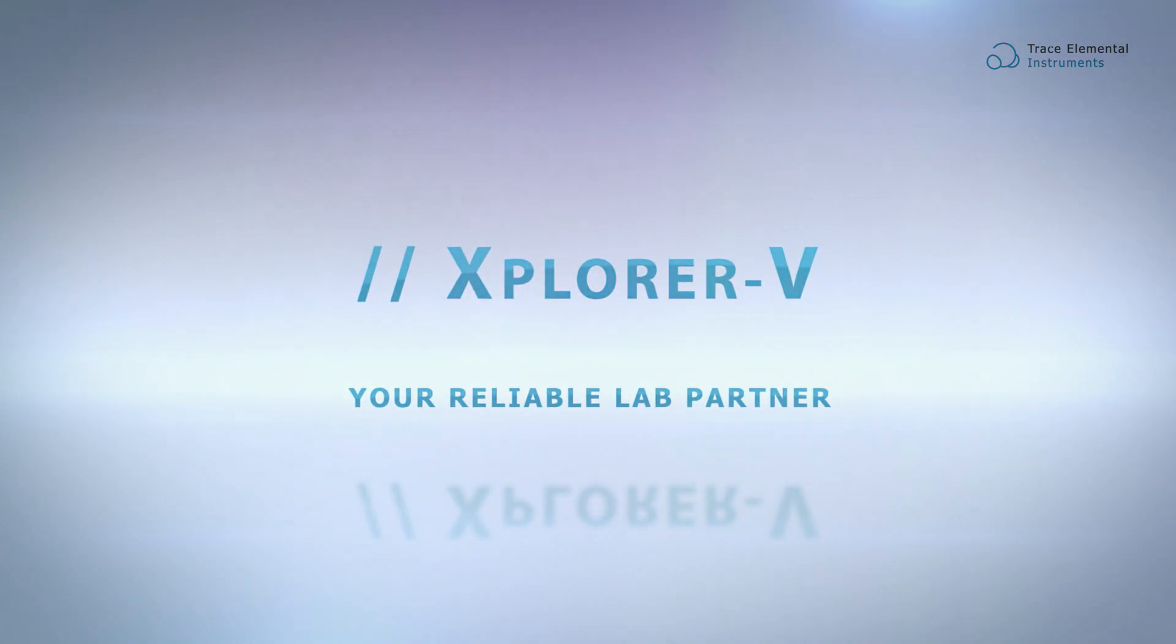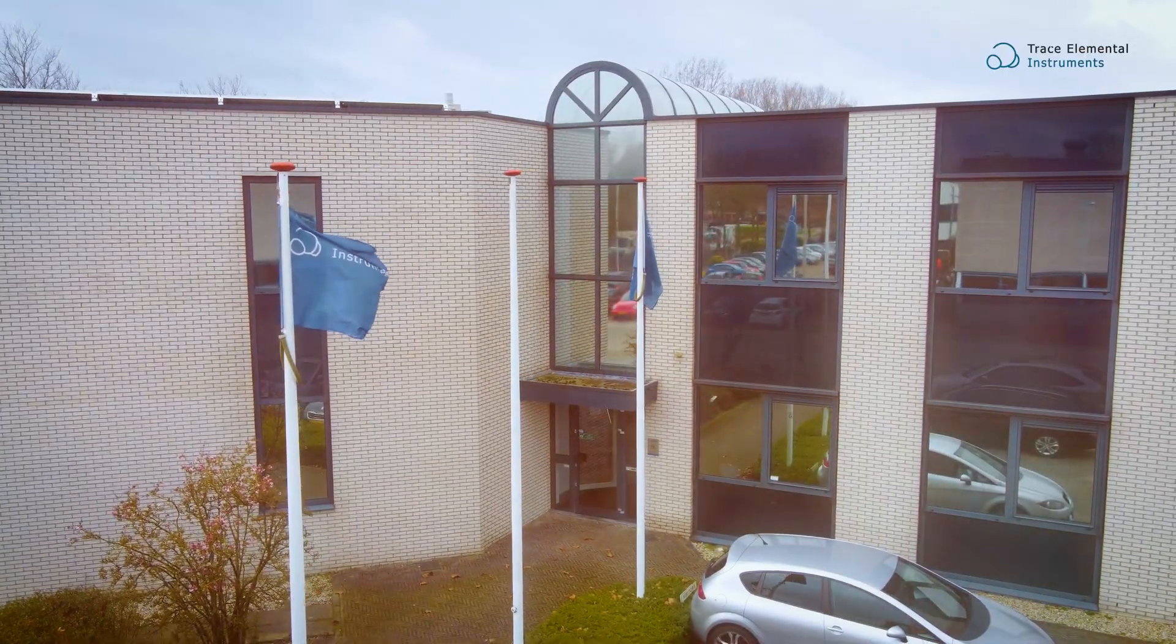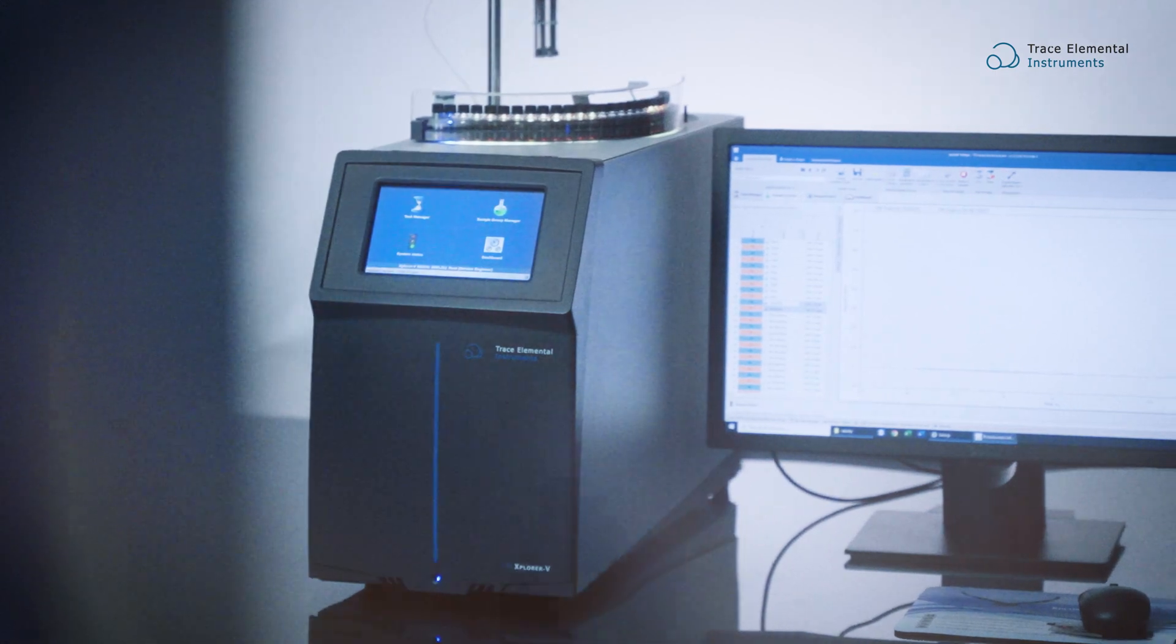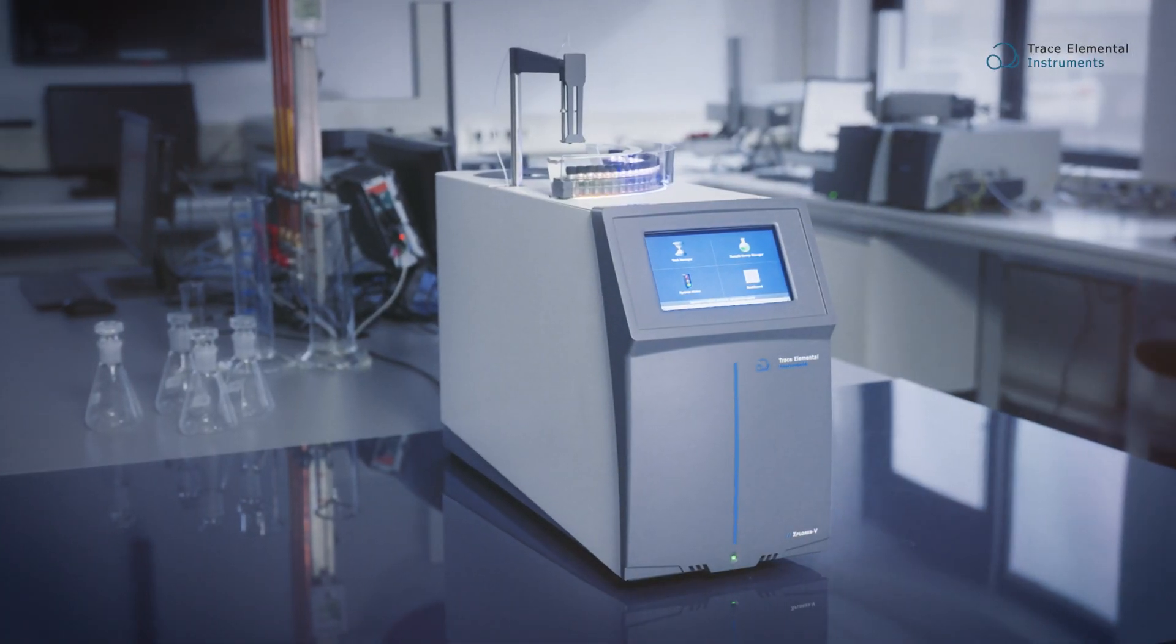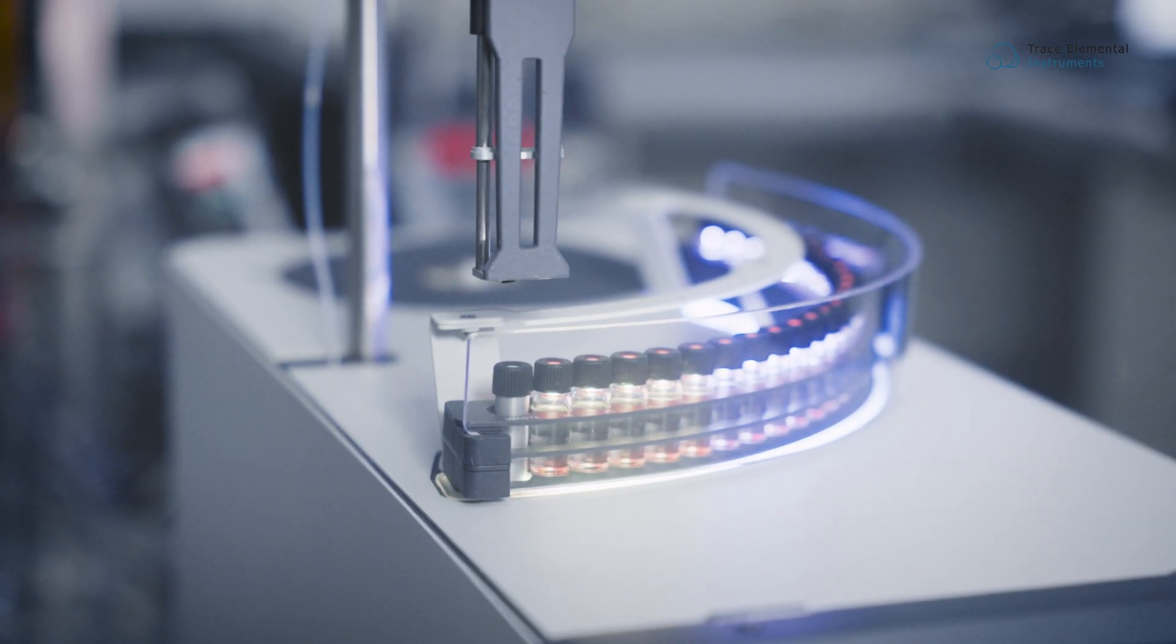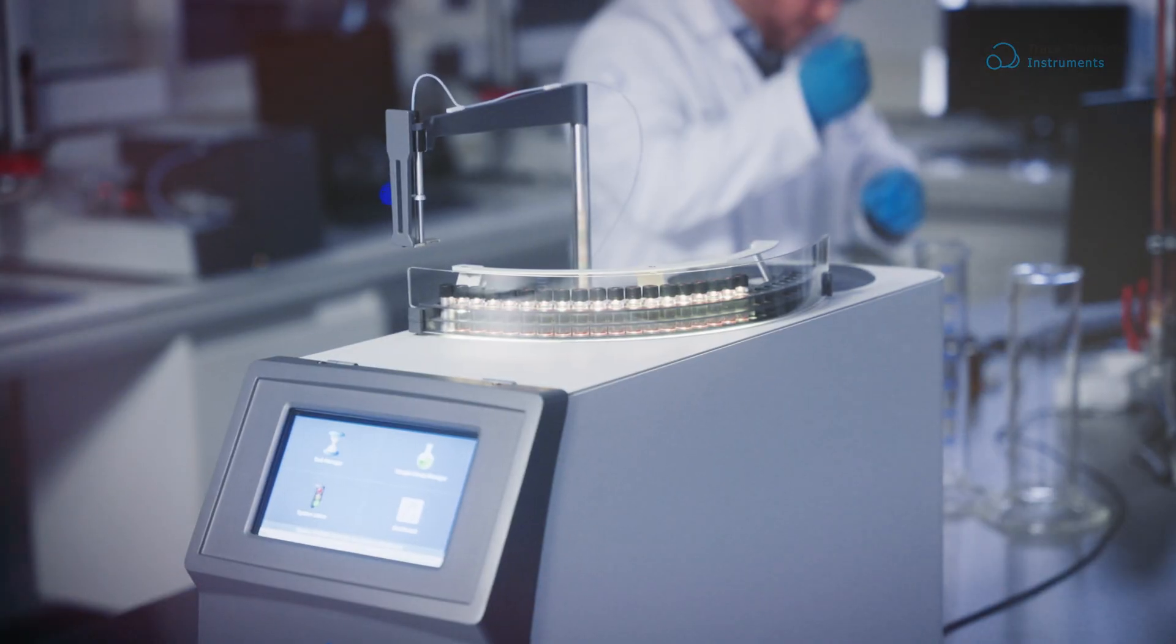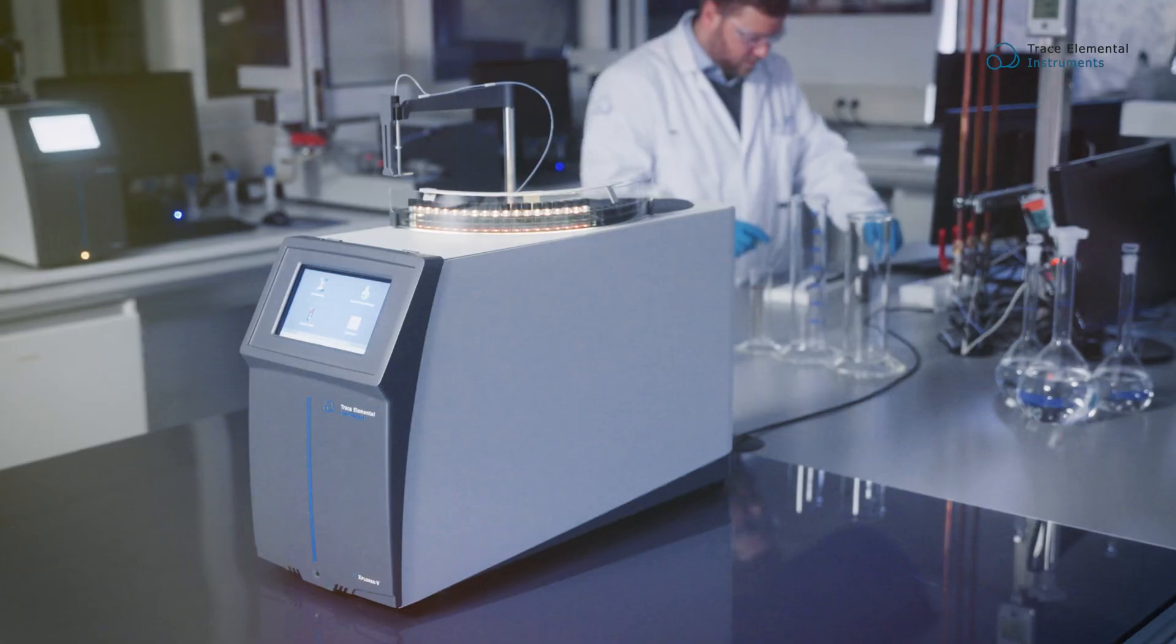We have the solution. Meet TE Instruments' new Vertical Combustion Analyzer. The Explorer V is your reliable lab partner for analysis of total nitrogen and total sulfur in hydrocarbon matrices and gases.